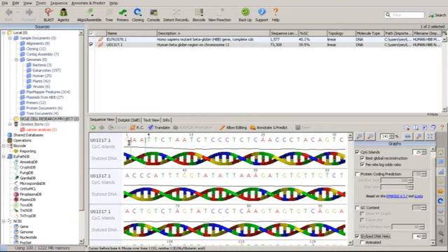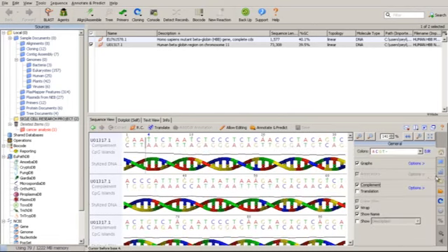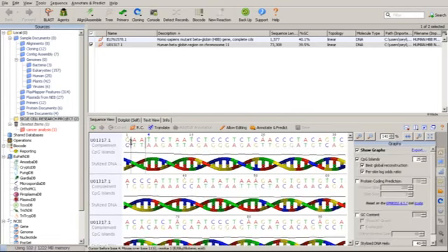You understand now? All you need to do for you to really understand is input the complement. So just come here and input the complement and go back. Just like you can see now, G is orange, while C is what? Blue. Now look at this region. A is what? Red. Look at it.